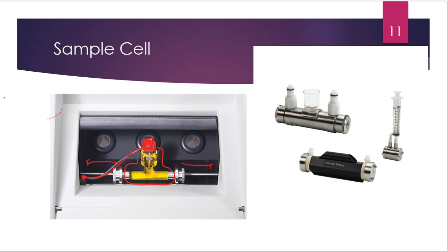Over on the right-hand side, you're seeing different versions of sample compartments. Here we have a stainless steel one, and the stainless steel has what we call the cup on top. The cups are very easy. You just pour your solutions into the cups, and you slowly fill it up to at least the top, and a little bit above the sample compartment. So that's why the cup is there. It makes filling these sample compartments way easier than some of the other old school polarimeter tubes that we used to work with. You're also seeing that inside of the polarimeter here in the picture as well.